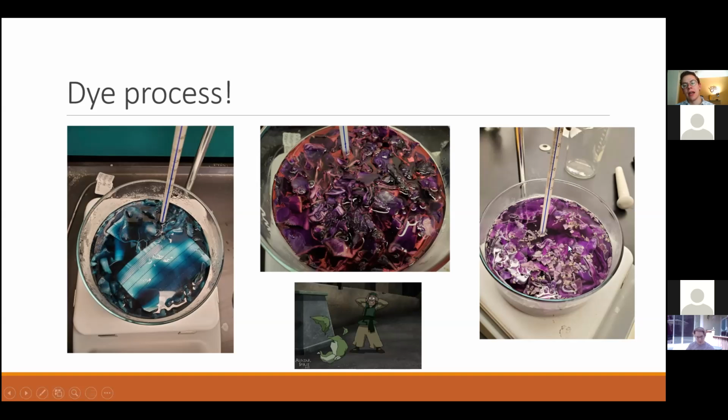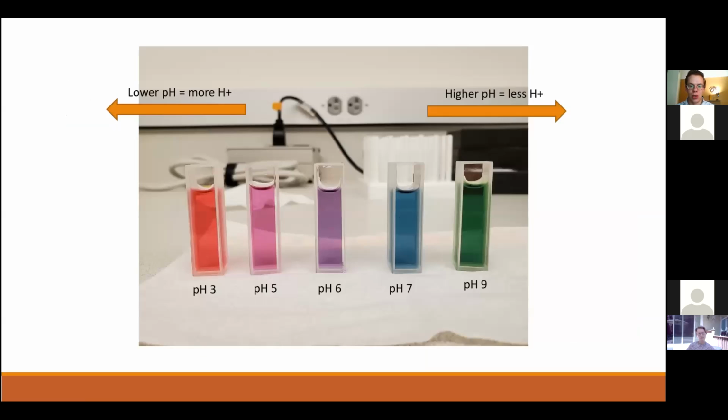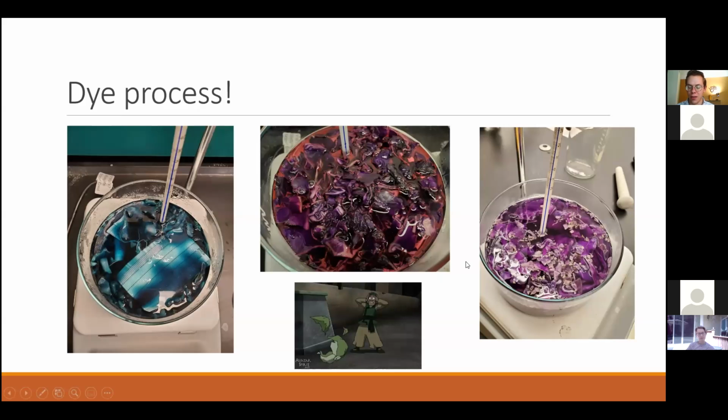This one on the right is at a neutral pH. So in water, there's no change in color. This is exactly what it looks like when you just have it. But as soon as you add acid, we see that we have a red color. And then when we add base, we get this greenish blue color. Please excuse the textile in there, but we see this color change. And that's pretty interesting. Shout out to Cabbage Merchant over here, for those of you who are waiting for that.